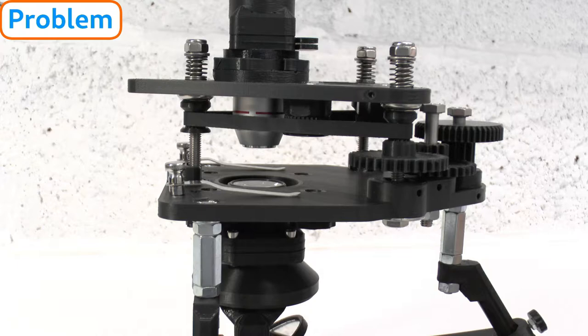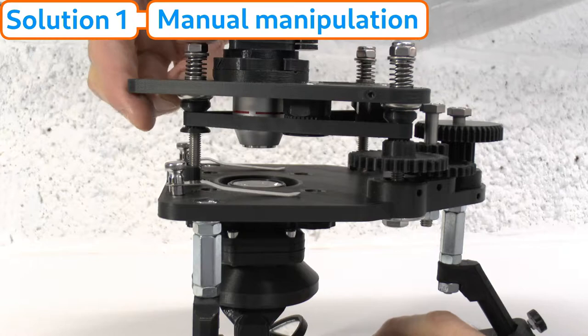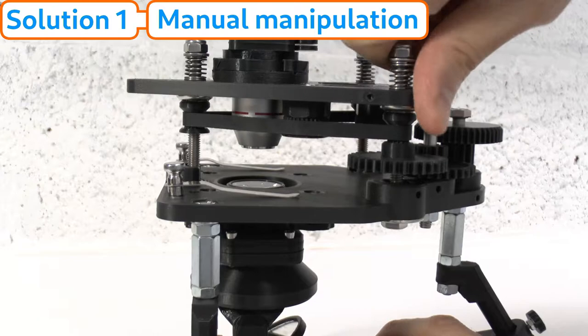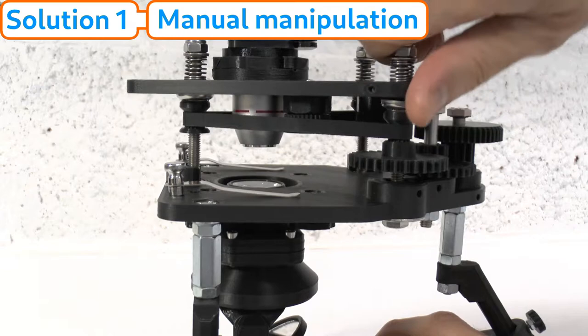Fortunately there are three things you can do to remedy this problem. The first and simpler solution is manual manipulation. A sticky focus platform may be a one-off occurrence for scopes that have been stored with the focus platform fully raised for some time — this is how commercially available foundation scopes are stored in their original packaging. Simply lowering the focus platform and manually sliding it up and down on its focus post at each corner a few times may be all that is needed to fix the issue.